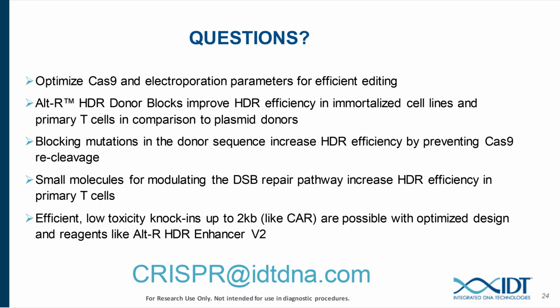Great. Okay. Oh, here's another question. So someone is asking, when should I use a donor oligo versus a donor block?